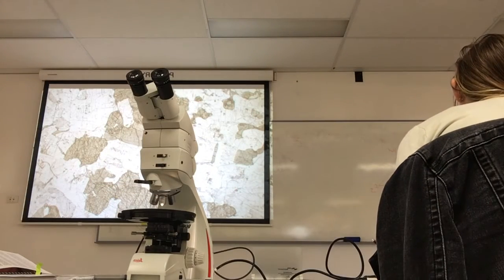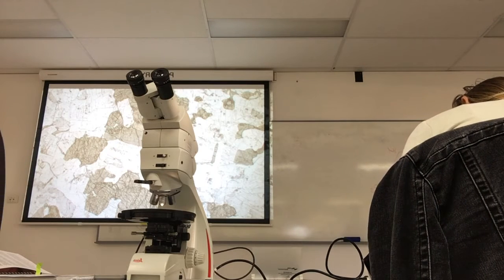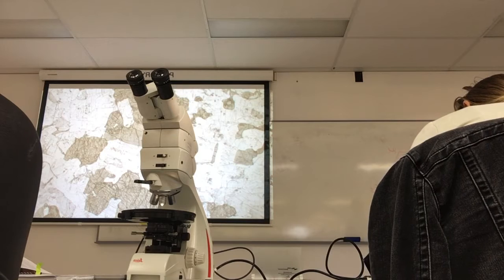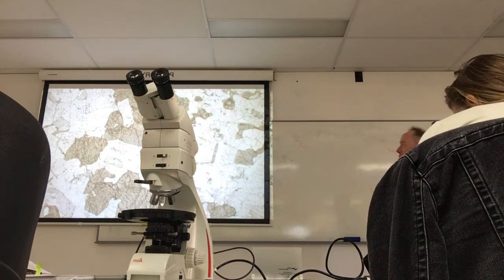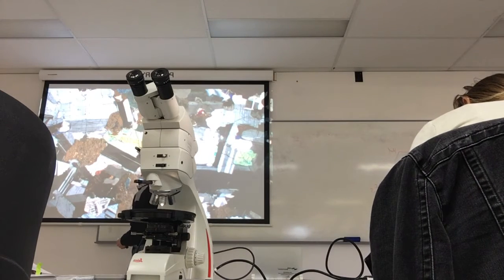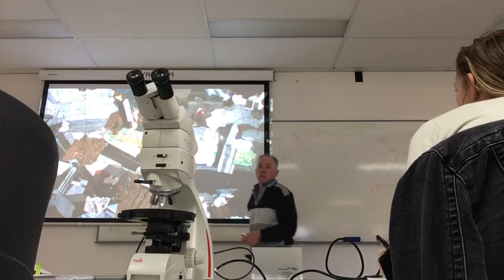Now they're quite happy at high temperatures, but just like orthoclase feldspar, they will go their separate ways as the rock cools down. And because they're solid, that happens in a solid state, so you get exsolution. So you get a texture just like perthitic texture, where you get the plagioclase inside the orthoclase, but in this case here, we've got the hypersthene inside augite. Okay, I'll just zoom in on that one a bit.